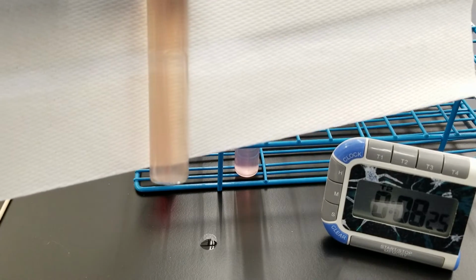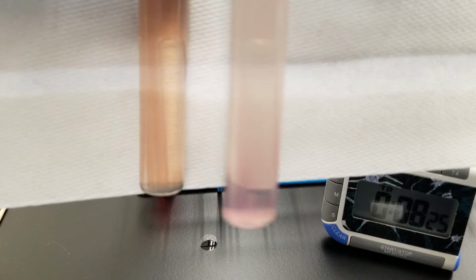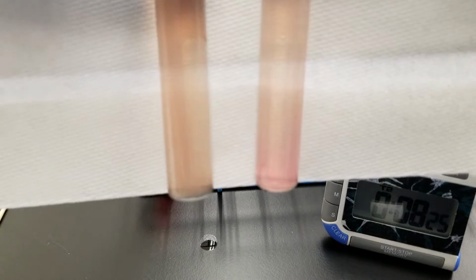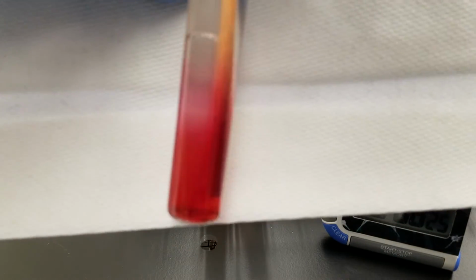It's been a couple of minutes, and this one is starting to turn. This one's the Neisseria. It was kind of hard to tell, so I had to get a paper towel to put behind it. So here's the Moraxella on the right. Neisseria is on the left. It's turning red, so that would be a true negative as well. So we have true negative on the negative control. That one's super duper pink. It's got the stick in it, right?